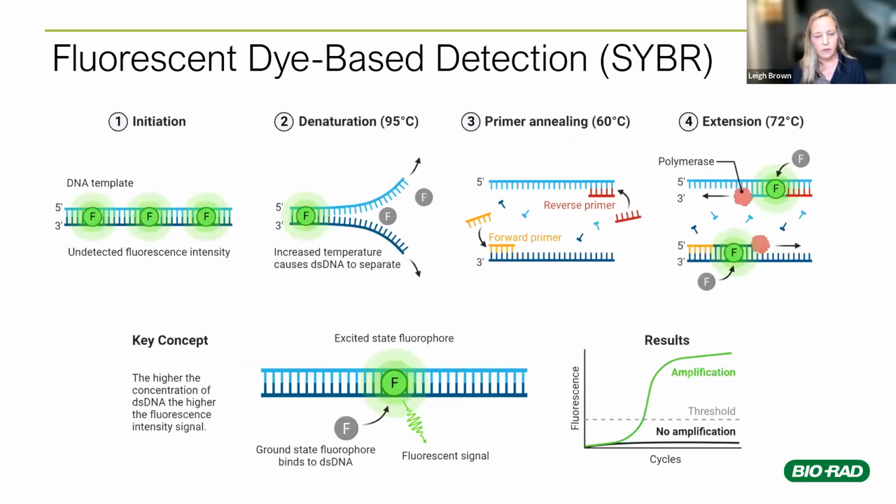And so here's kind of what that might look like, if you think back to that previous slide with conventional PCR. With our template, SYBR is kind of non-discriminatory. It's going to bind to any double-stranded DNA. So even with our starting DNA, we're going to have SYBR binding here and fluorescing. But there's so little of our DNA template at this point that the real-time system isn't going to pick that up.